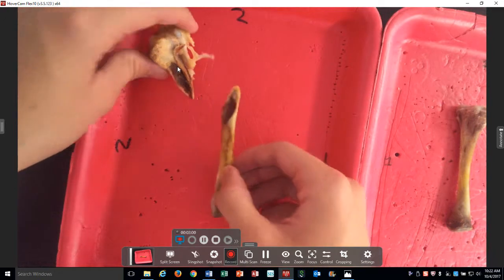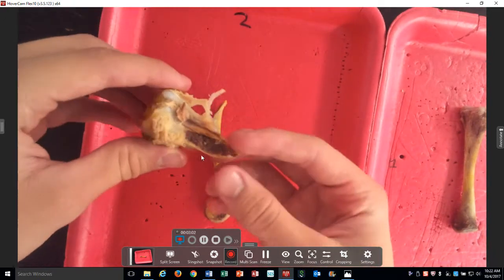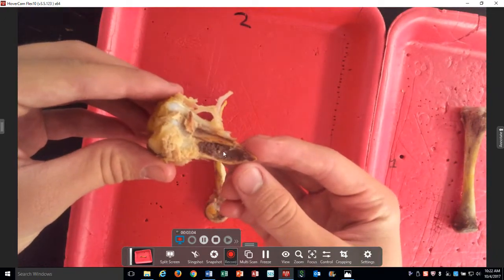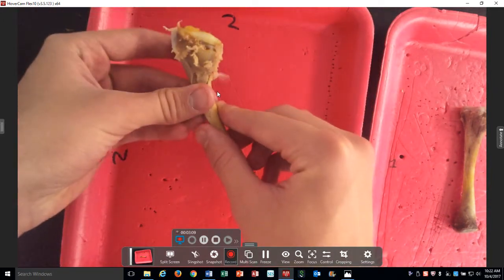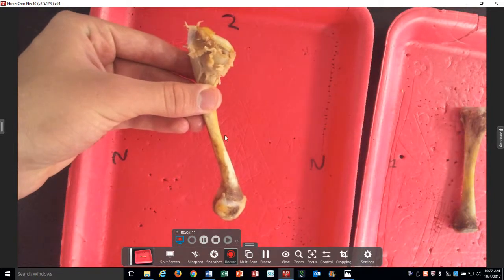Hold that up so we can see. Right inside there, that's the marrow. Kind of put it back together as if it weren't broken. All right, we're still going to dissect this.